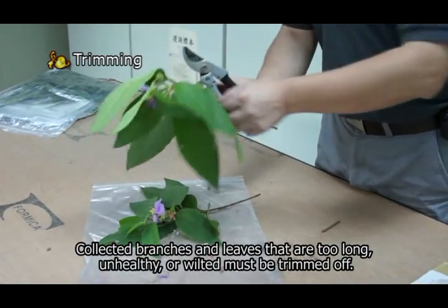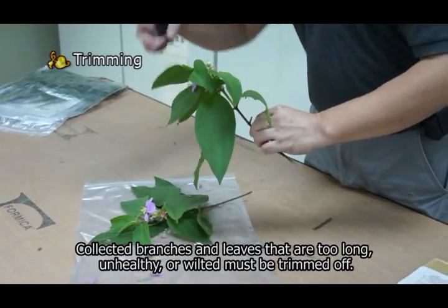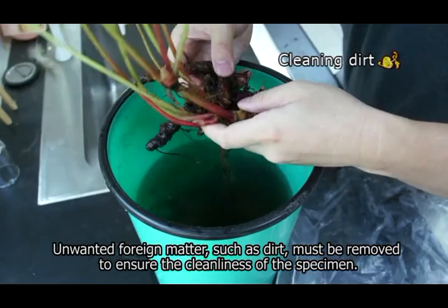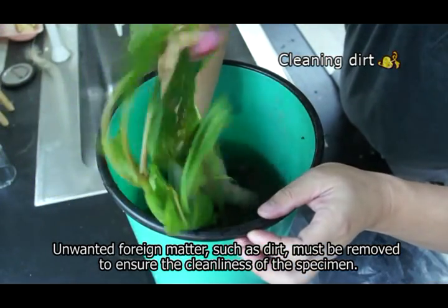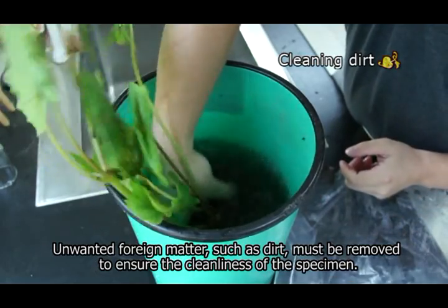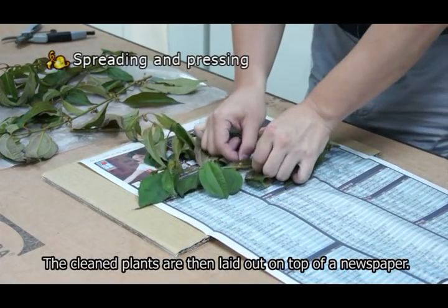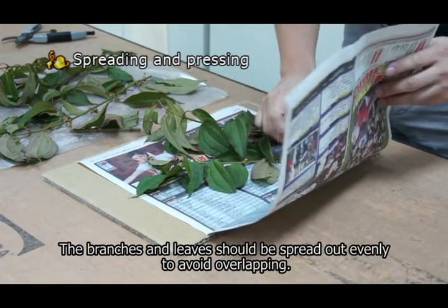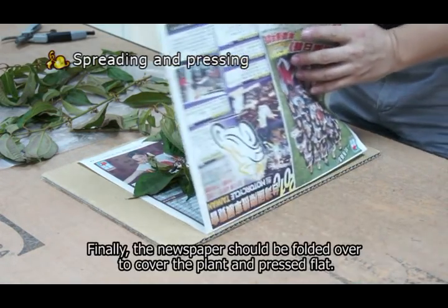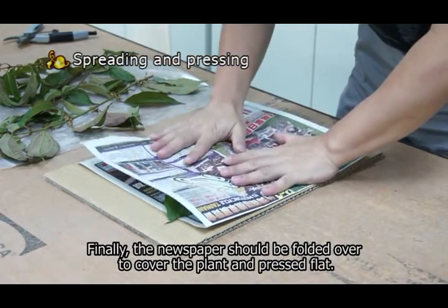Collected branches and leaves that are too long, unhealthy, or wilted must be trimmed off. Unwanted foreign matter, such as dirt, must be removed to ensure the cleanliness of the specimen. The cleaned plants are then laid out on top of a newspaper, and the branches and leaves should be spread out evenly to avoid overlapping. Finally, the newspaper should be folded over to cover the plant and pressed flat.